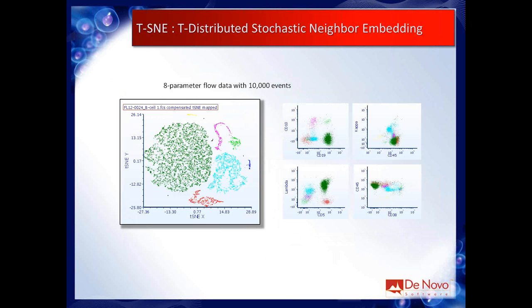So here's just a screenshot from FCS Express. You can see I've got some high parameter flow cytometry data. And there are some populations that you can see if you go through and try to gate it in different dimensions, but not all of them are separable in all of them. So tSNE has taken that. We've done a dimensionality reduction and extracted 2 parameters from all of these parameters. And it's taken these and pushed them all together, all the cells that are close together, and it's also tried to create this segmentation between the distinct groups by exaggerating the spaces in between them.